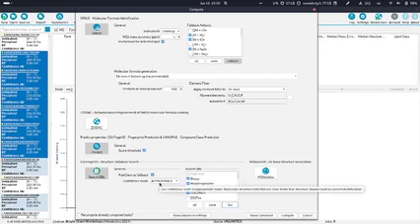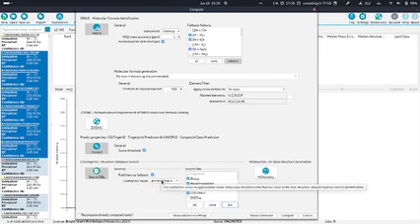What we also have here, which was also added in SIRIUS 6, which Kai already talked about, is that we can now switch the confidence mode, the confidence score, to approximate mode, which also, I will show an example to make this a little bit clearer, considers very similar structures to assign the confidence. But here you would be able to switch between approximate and exact, but you can also do this in the main window. You don't have to do it in a computation. I will show it later.